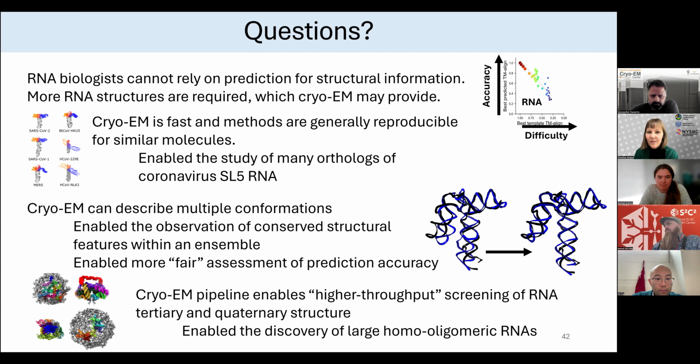What I said at the start about three-dimensional structure being dictated by tertiary interactions: most of these viral RNAs are just four helices and don't really have anything keeping them tight together or in a defined form. That's the reason they're pretty low resolution, and also the reason you need a lot more data than you would for something highly ordered or globular. For those, it's on the order of 1 million particles for each of those reconstructions.